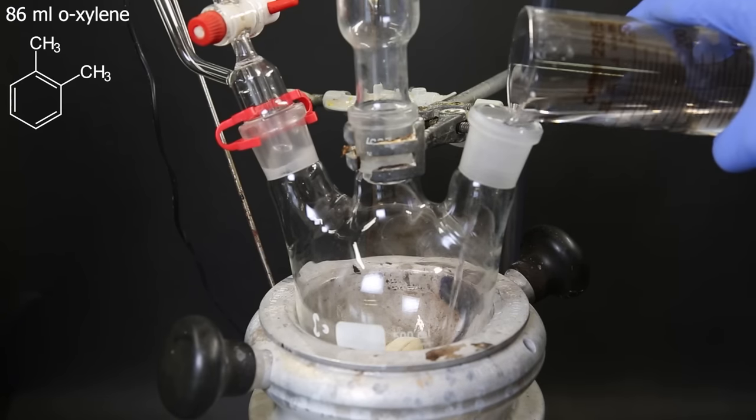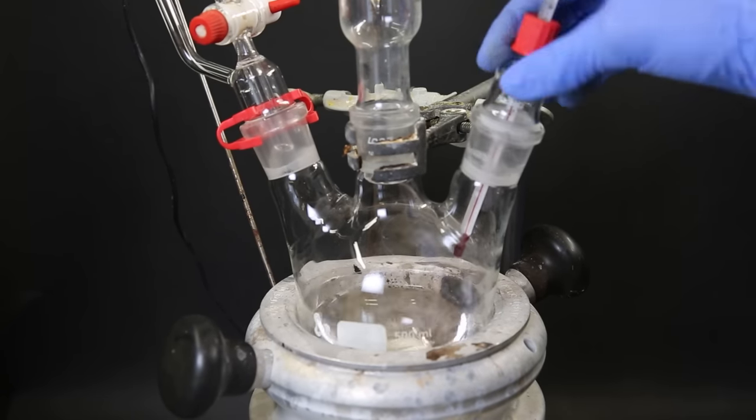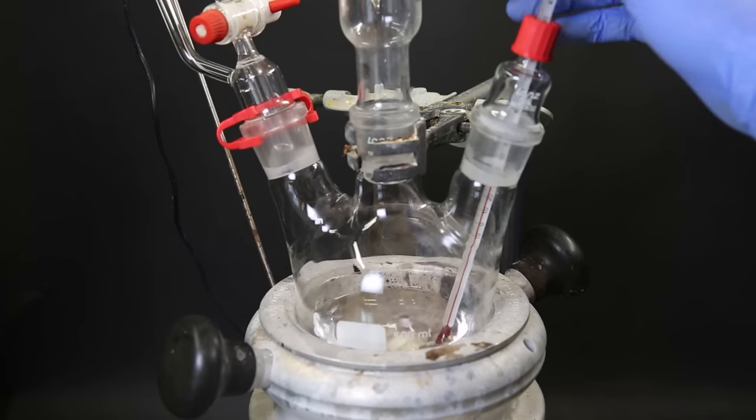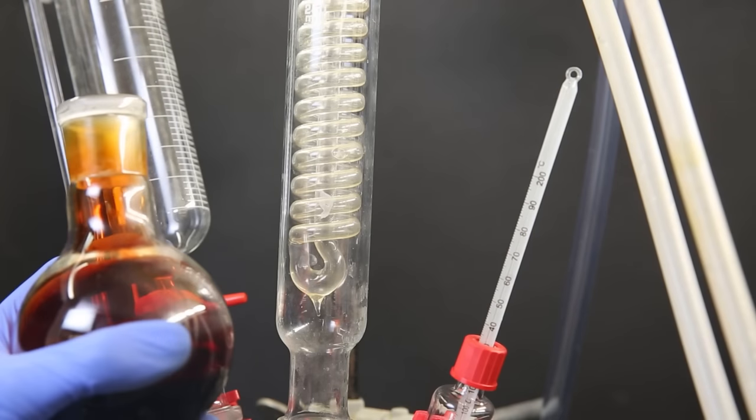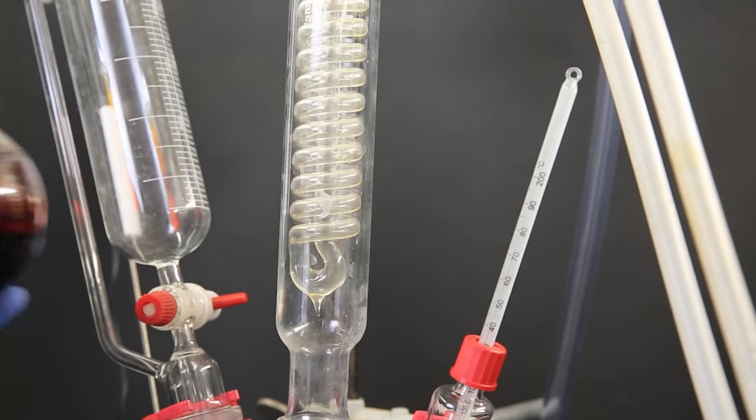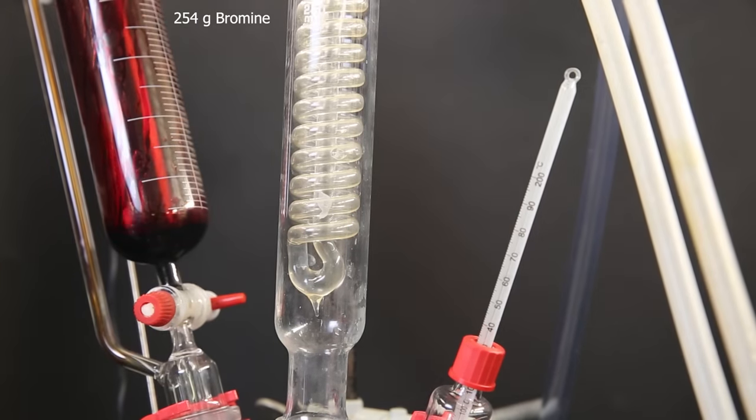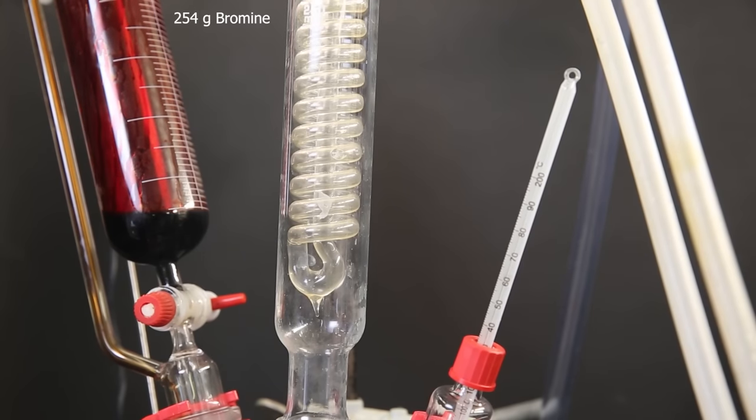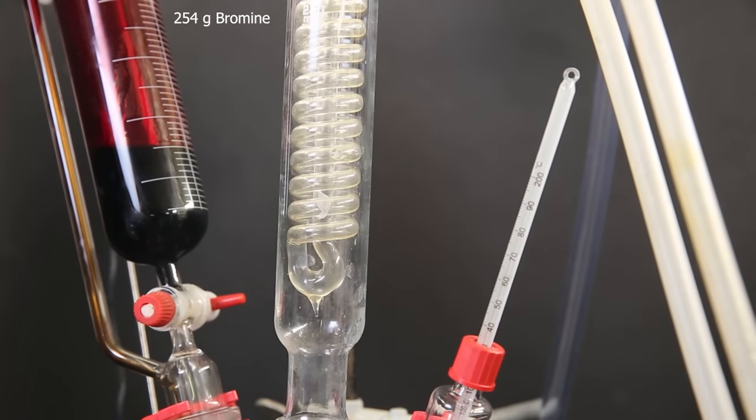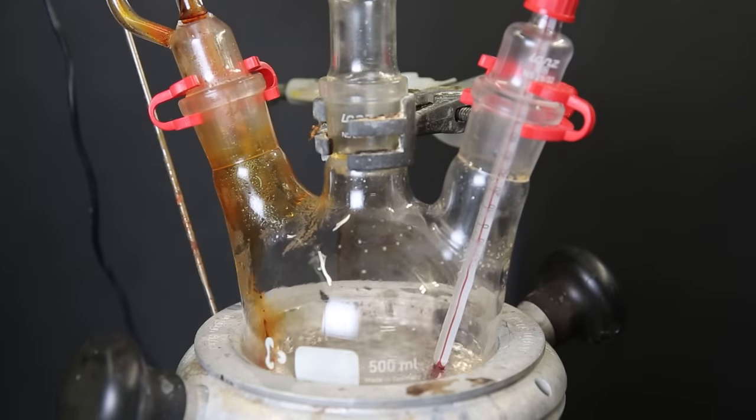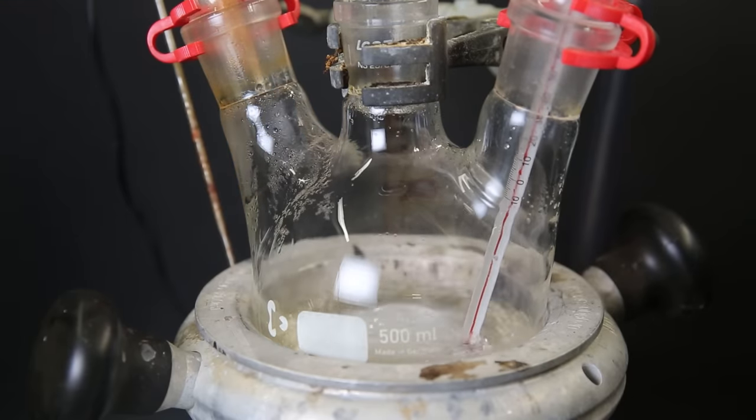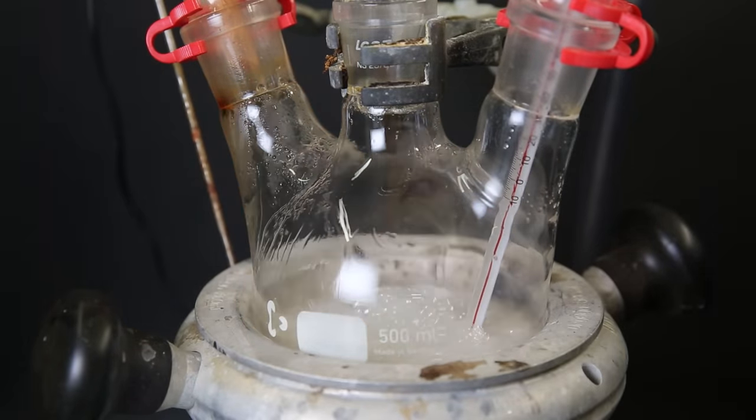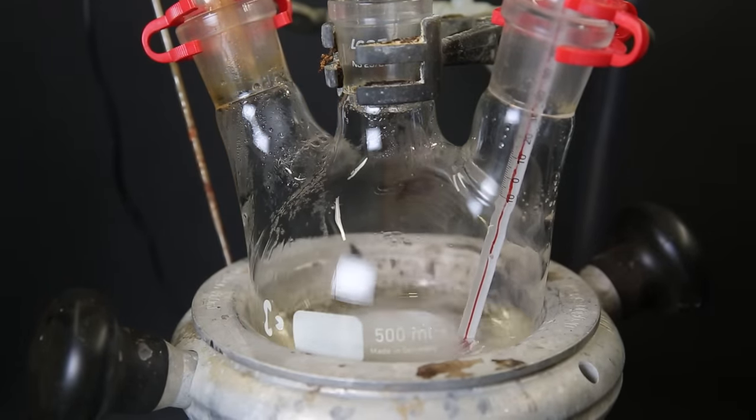Now to the flask, I add in 86 mL of o-xylene, and then attach a thermometer that reaches into the xylene. I start heating the xylene to a reflux, and then to the dropping funnel I add in 254 grams of freshly prepared bromine. A little bit went into the arm of the dropping funnel and into the flask, but this doesn't really matter for this reaction. Now I open the dropping funnel and start adding the bromine dropwise to the boiling hot xylene. I also set up a strong lamp nearby to illuminate the setup, because the light will hit the bromine and produce two radicals that will react with the xylene.